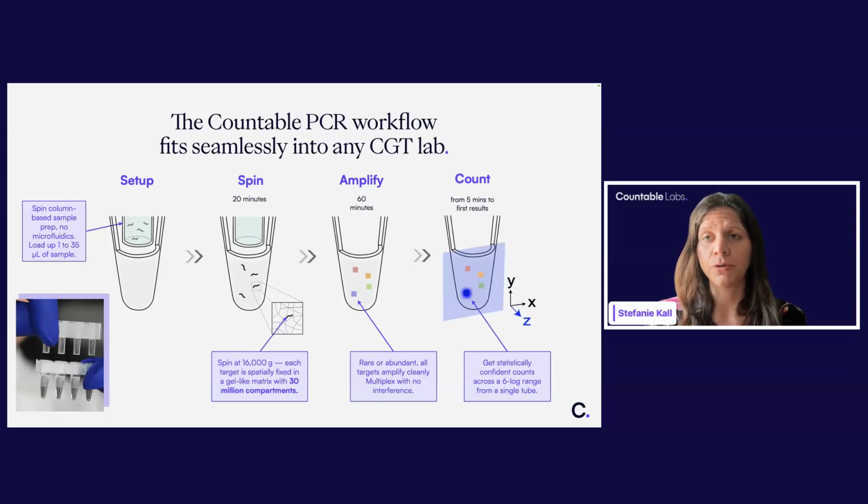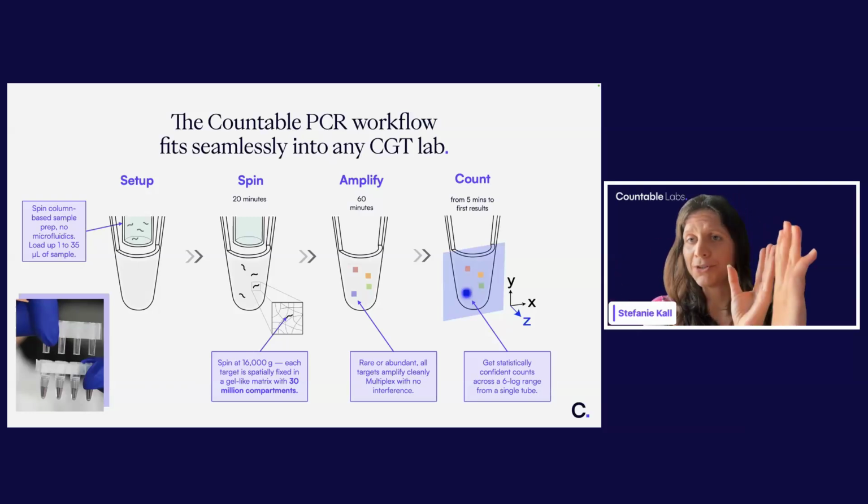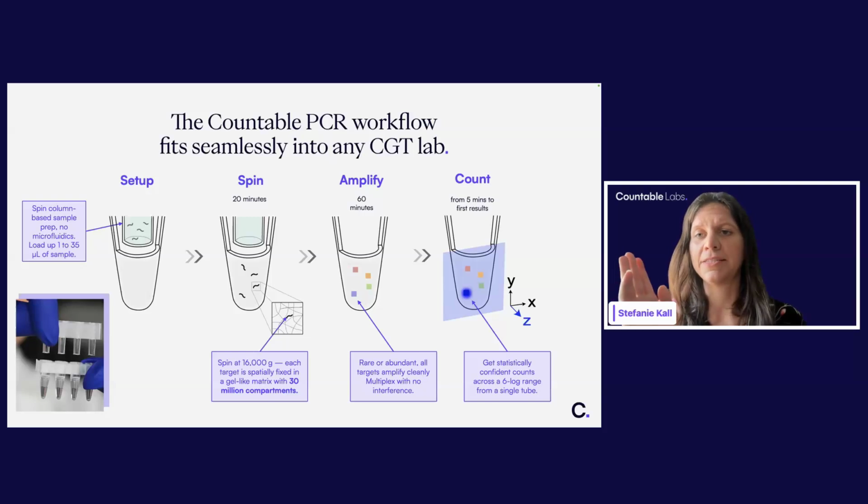In our countable system, there is a light sheet imaging. It moves across the tube like this, and it scans hundreds of light sheets in 40 seconds in order to literally build in 3 dimensions which compartments are giving signal for a given probe channel.